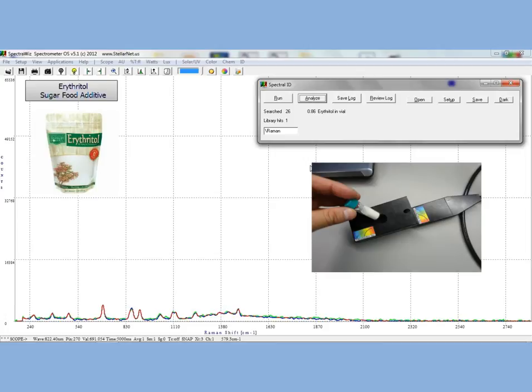Once you hold down the red laser fire button, you will collect the Raman Spectrum of your sample. Go ahead and click on the Analyze button and the Spectral ID to see the erythritol match.